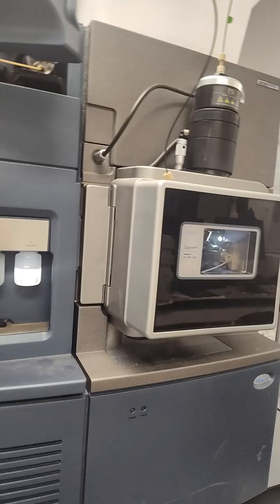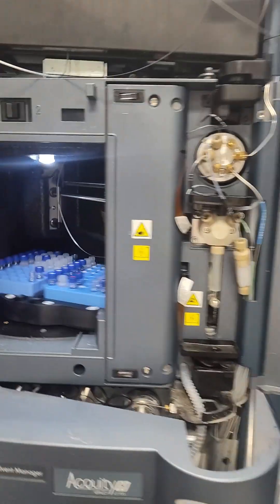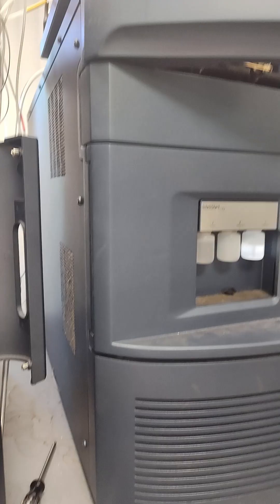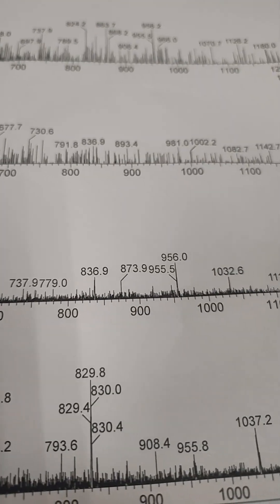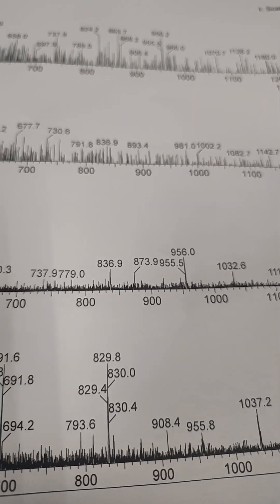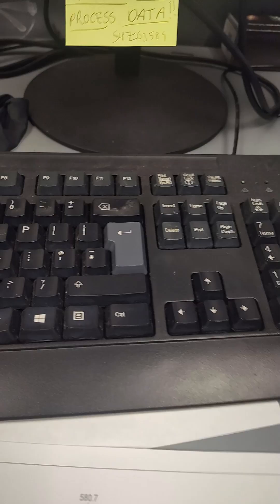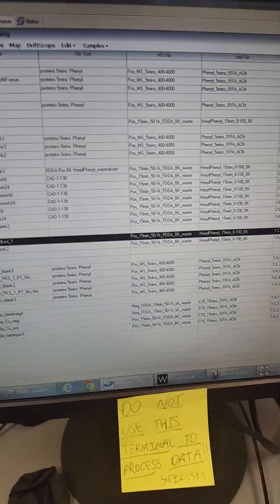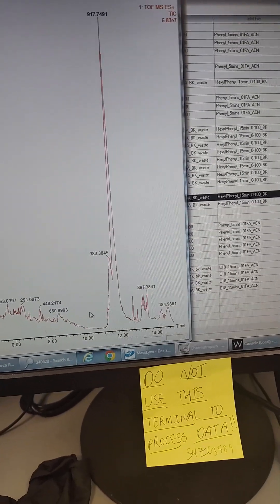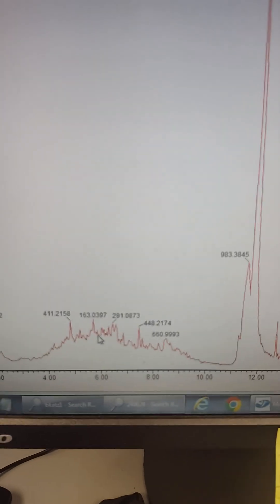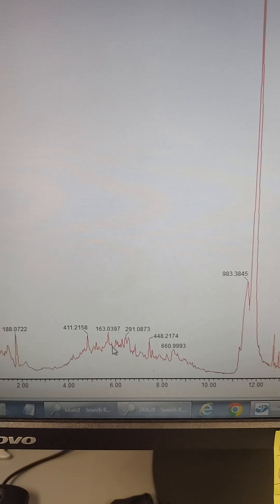Finishing up the red kiwi data. Figuring out that anthocyanin and red pigment. Zevo Qtof. Got to use the high res so we can get fragment data. So again, we're looking for either that 580 mass or something that associates with it. Maybe that 9.6. I don't really know. Let's go ahead and look at it.